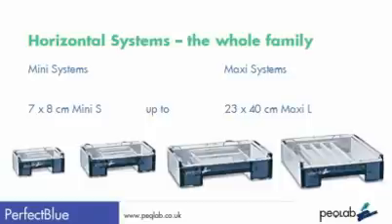Let's start with horizontal tanks. There are 12 systems in this range, from the 7x8cm mini small, right up to the maxi large and extra-wide models.